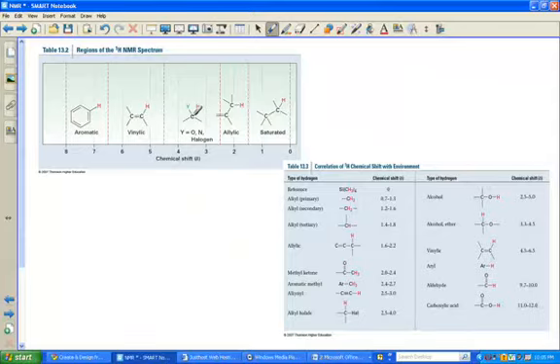However, when you've got a hydrogen between 2 different functional groups, it could be somewhere other than one of these regions shown. The most important region, I think, for you guys to see is this one right here, because this one virtually never changes. Aromatic ring hydrogens are always going to be between about 6.5 and 8 ppm. And yes, it's true, the hydrogen is not connected to something electronegative, but for reasons involving the resonance and delocalization within the ring, these hydrogens are particularly downfield.